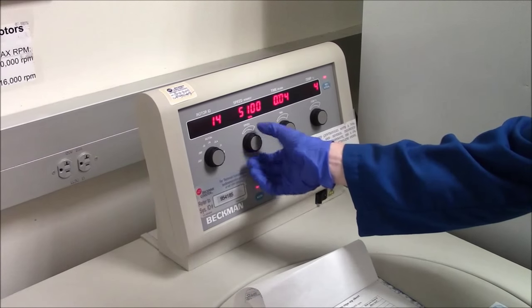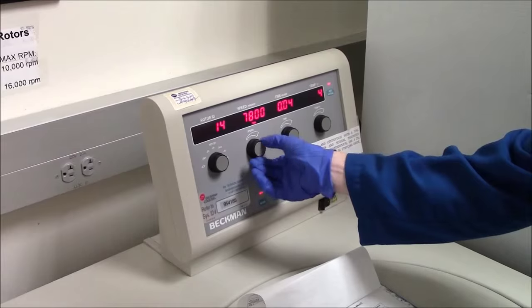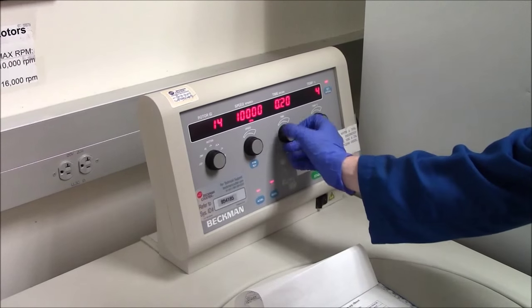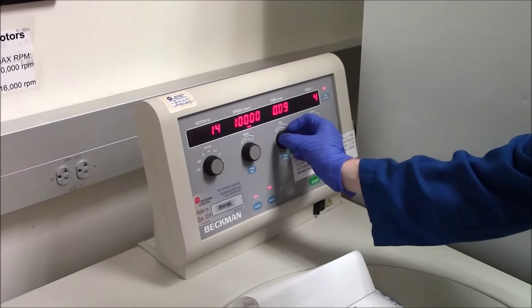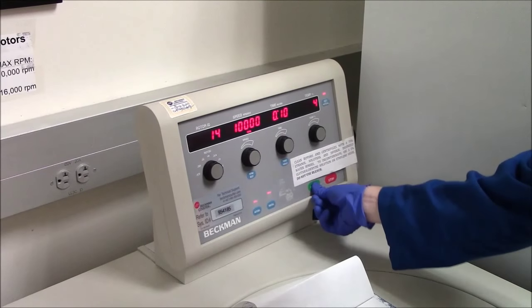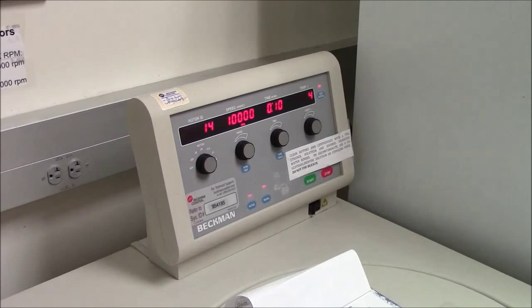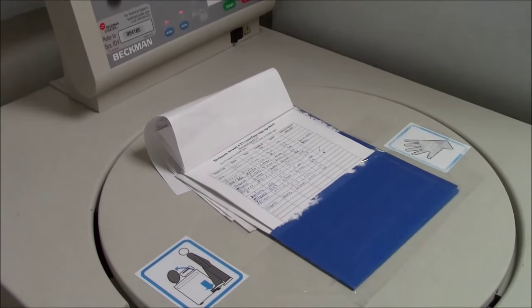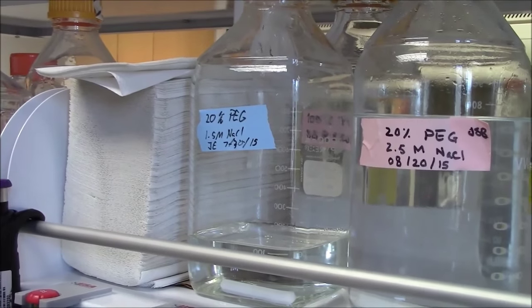This spin will be to pellet the bacterial cells, and you want a speed of about 10,000 RPM, about 10,000 G, and 10 minutes will be sufficient. This is a refrigerated centrifuge. 4 degrees C is the right temperature. Alright, it's time for the PEG.